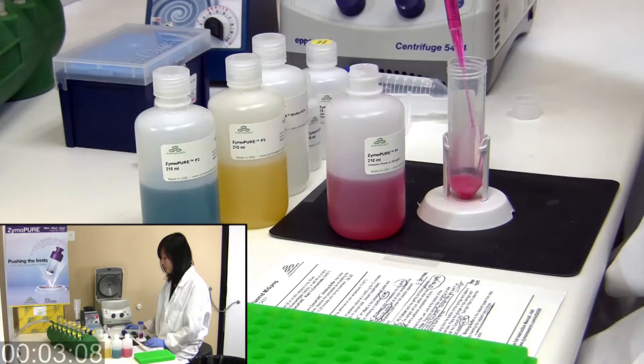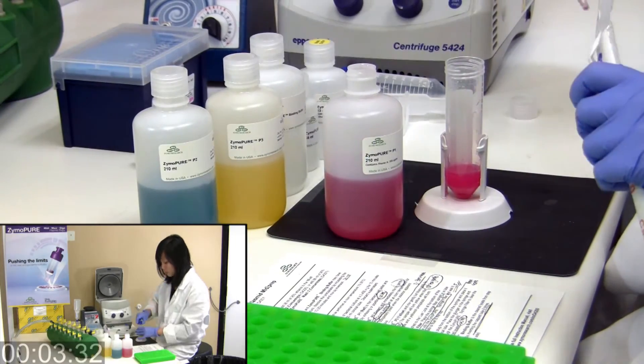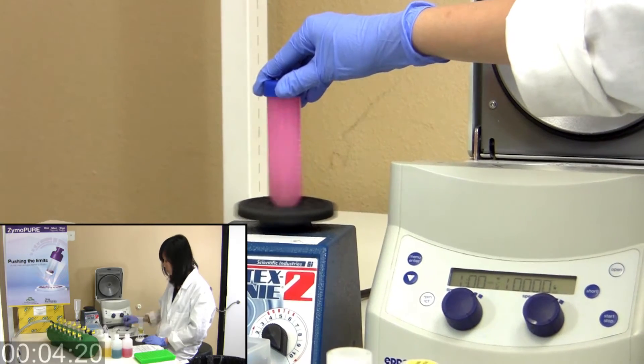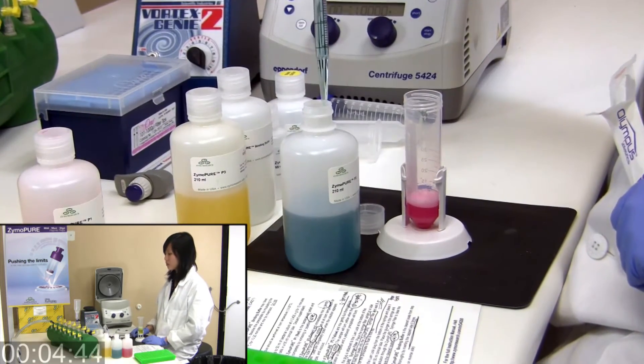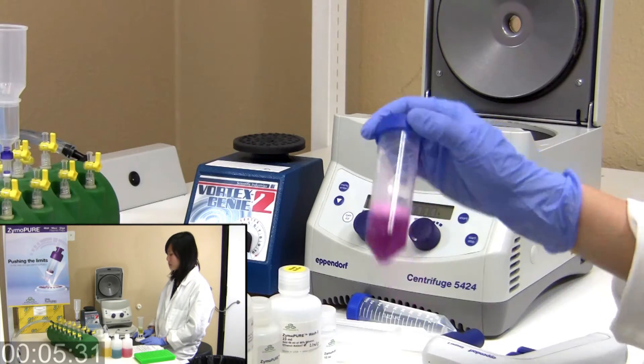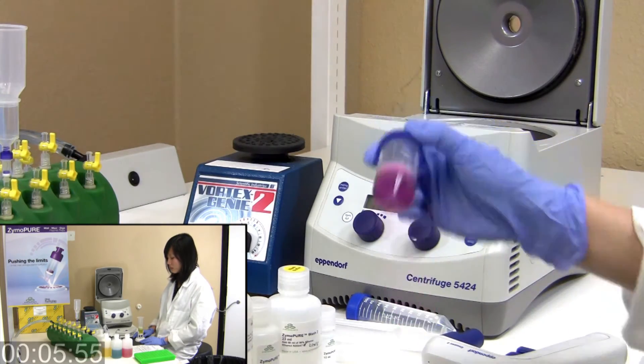Begin by re-suspending your E. coli cell pellet in ZymoPure buffer P1. Use our patented colored buffer system for easy visualization of complete lysis and neutralization.